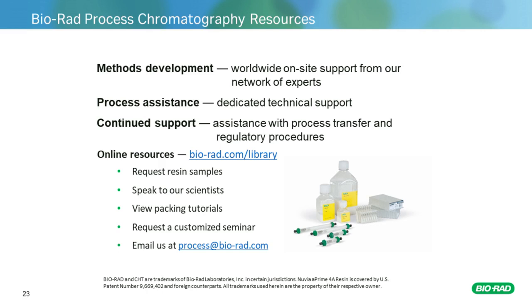Okay. And can it be a regulatory problem to have an additive in the buffer? I assume the additive needs to be removed after, or tests need to be performed that show that the additive does not end up in the final API formulation.